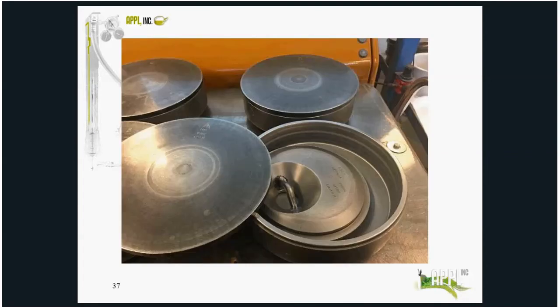These are the bowls that are used inside the puck mill. They are stainless steel bowls, and we put the soil in the bowl, and the puck is set on top. Then we put the top on it, put it in that grinder. It's important to keep the bowls and pucks identified in case of cross-contamination. The bowl, the ring, and the top are labeled as a unit. And I was hoping you'd be able to see that etched in the steel are the letters identifying each one uniquely.